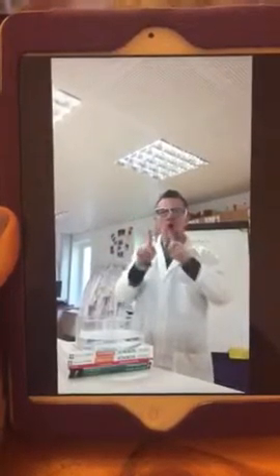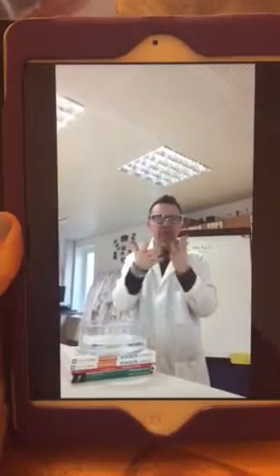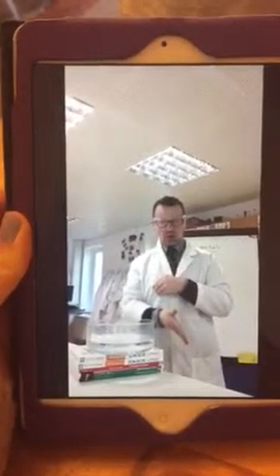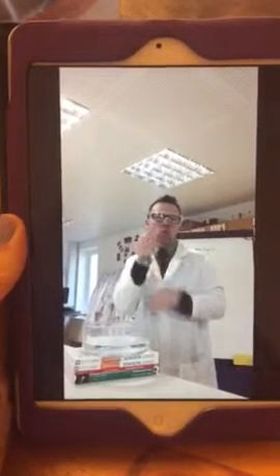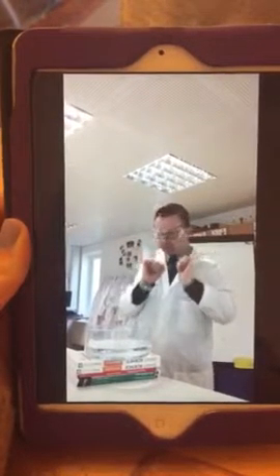Hello everyone, my name's Derek and today we're going to be talking about alkaline metals and the different reactions they're going to have. So we're going to have a look at the physical state of these metals and then how they react. So we've got lithium, sodium and potassium. These are all group 1 metals on the periodic table. They react with water and they also react with air.